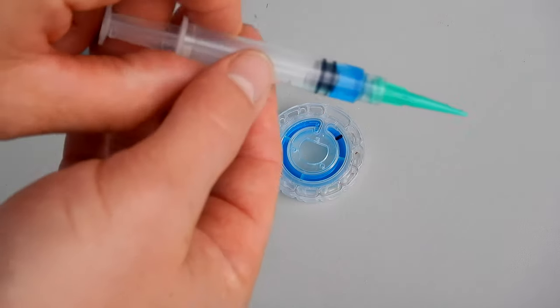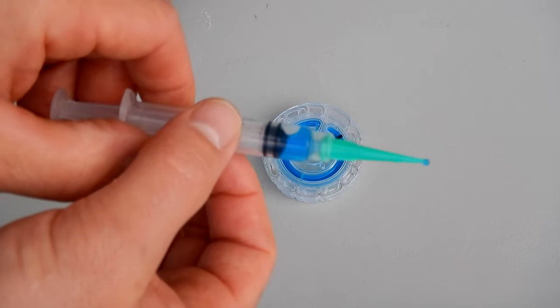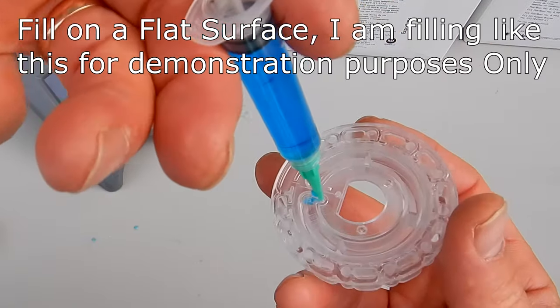It's properly filled. According to LaMotte, you should have about one centimeter of water left in the syringe if the disc is filled correctly. Here's another disc — as it fills the chamber you can actually see the water filling up the top of the chamber.